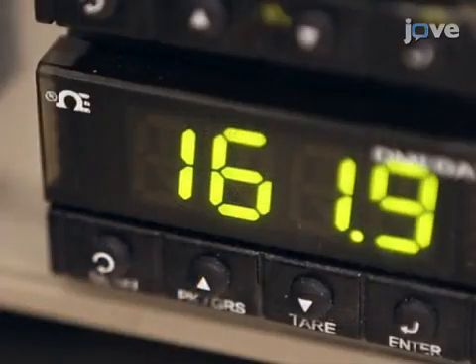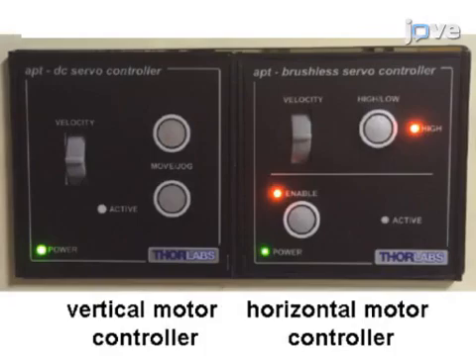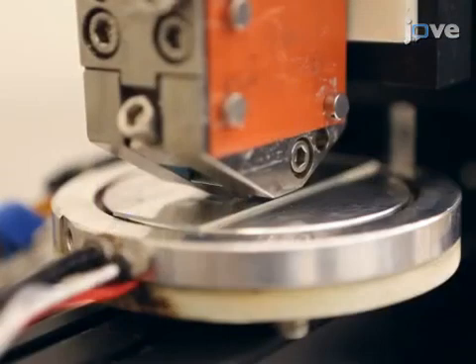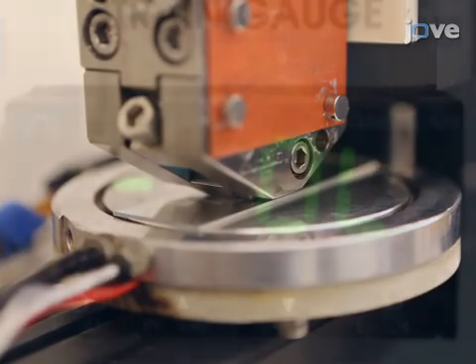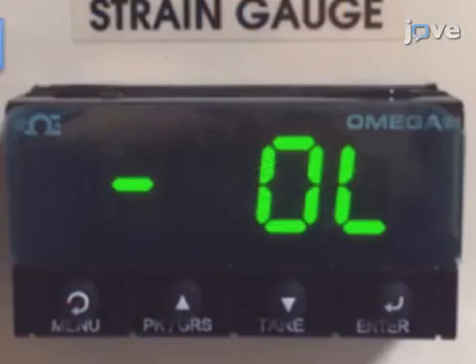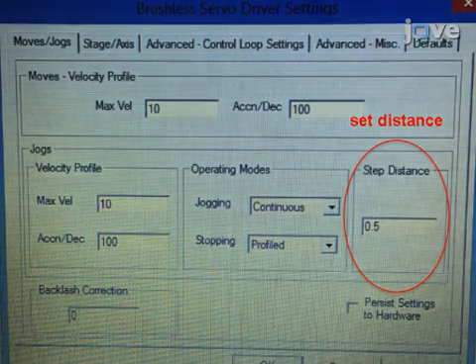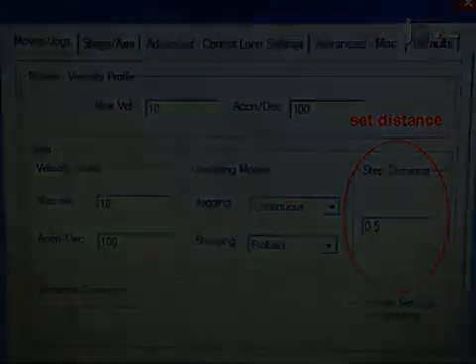Tune the head-to-substrate distance to zero. The vertical motor is coupled with a force sensor. When the printing head is floating, a constant force reading will be obtained from the weight of the printing head and the tilting manipulator assemblies. Once the printer head touches the substrate, the reading will reduce, marking the zero position. Set a head-to-substrate value to run the experiment. In this experiment, set the head-to-substrate gap to 100 microns.